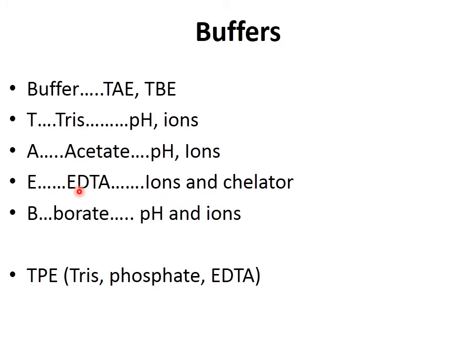It binds to metal ions, positively charged metal ions, and many of the enzymes which act upon nucleic acids require magnesium ions as a cofactor.